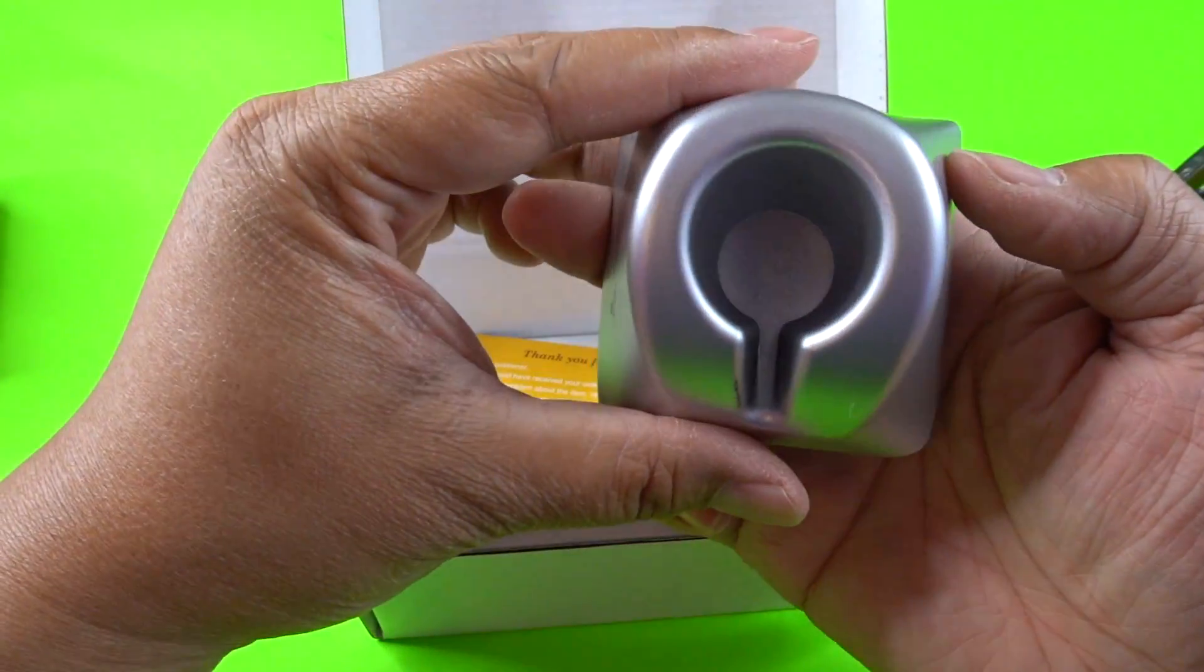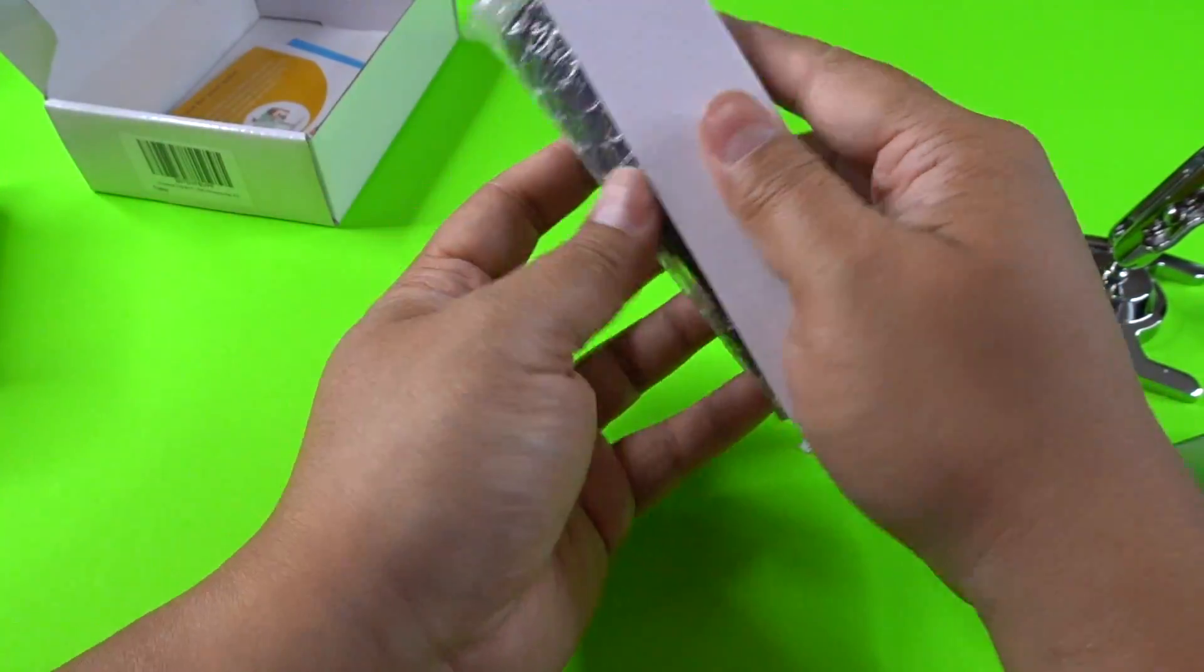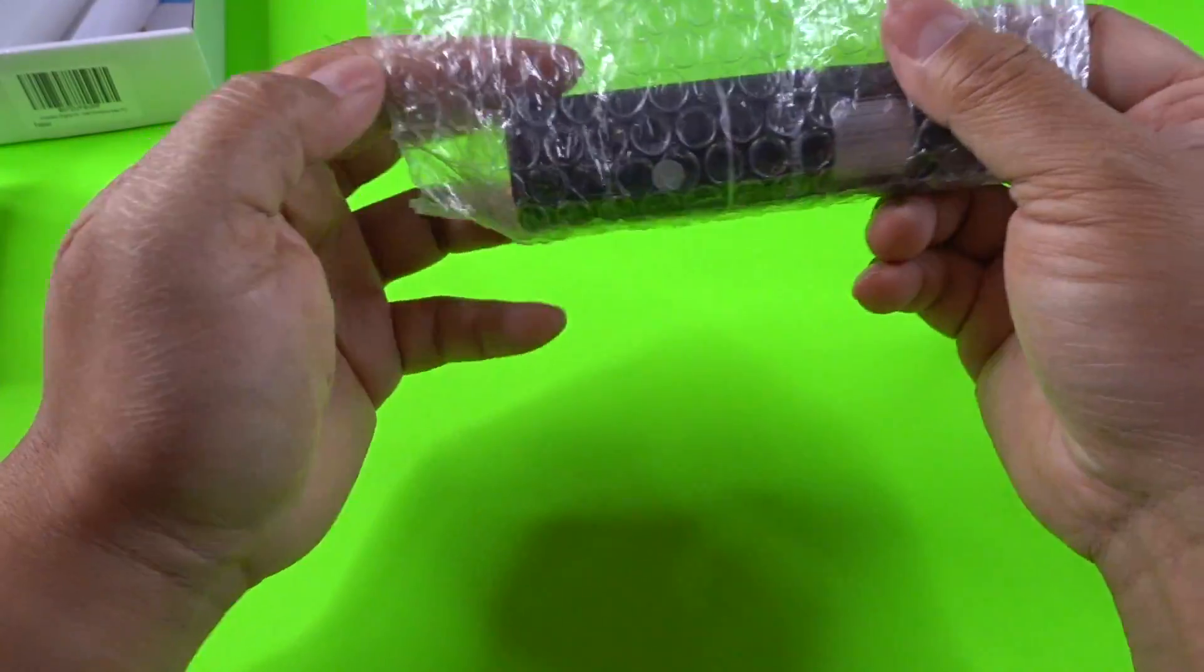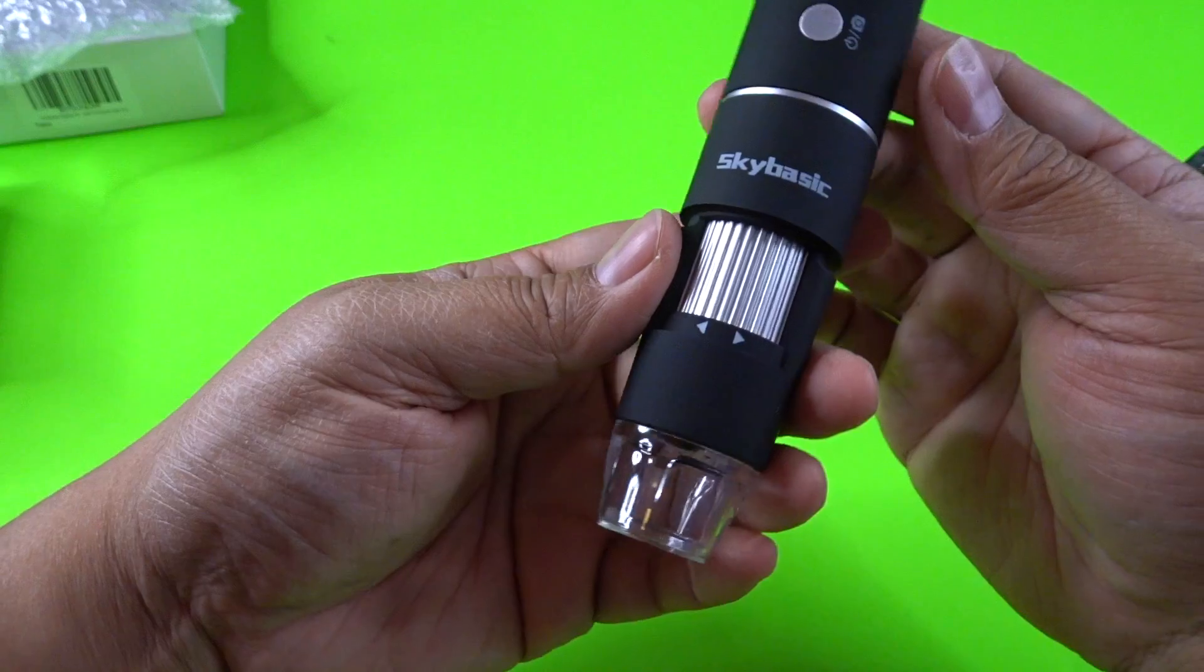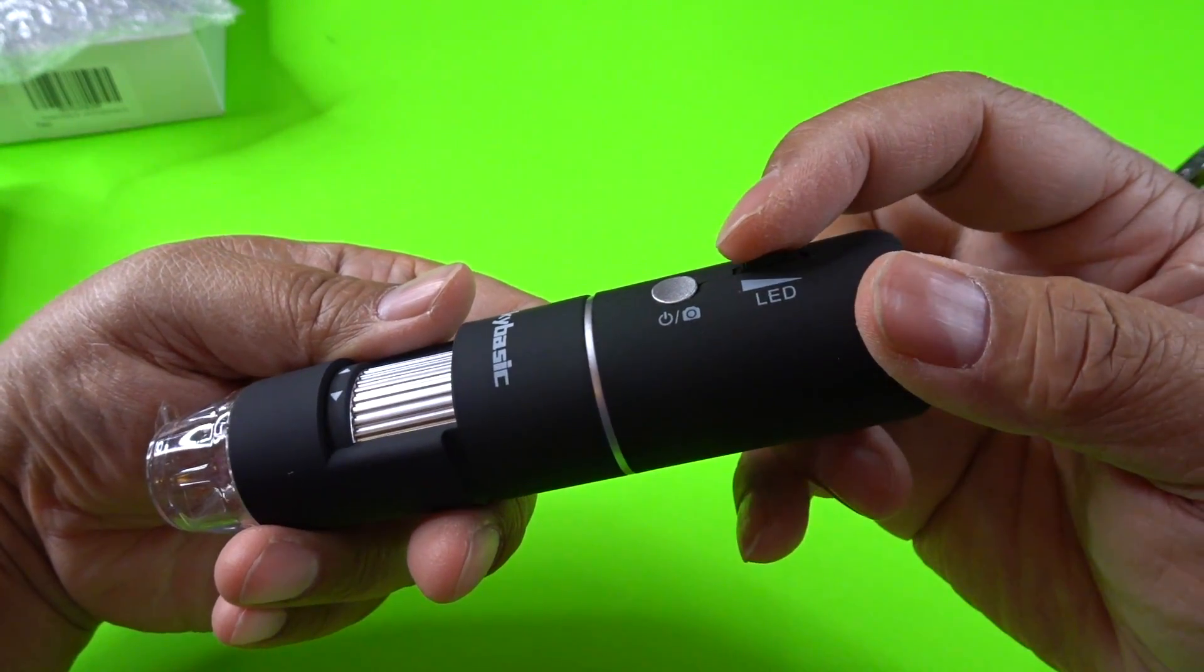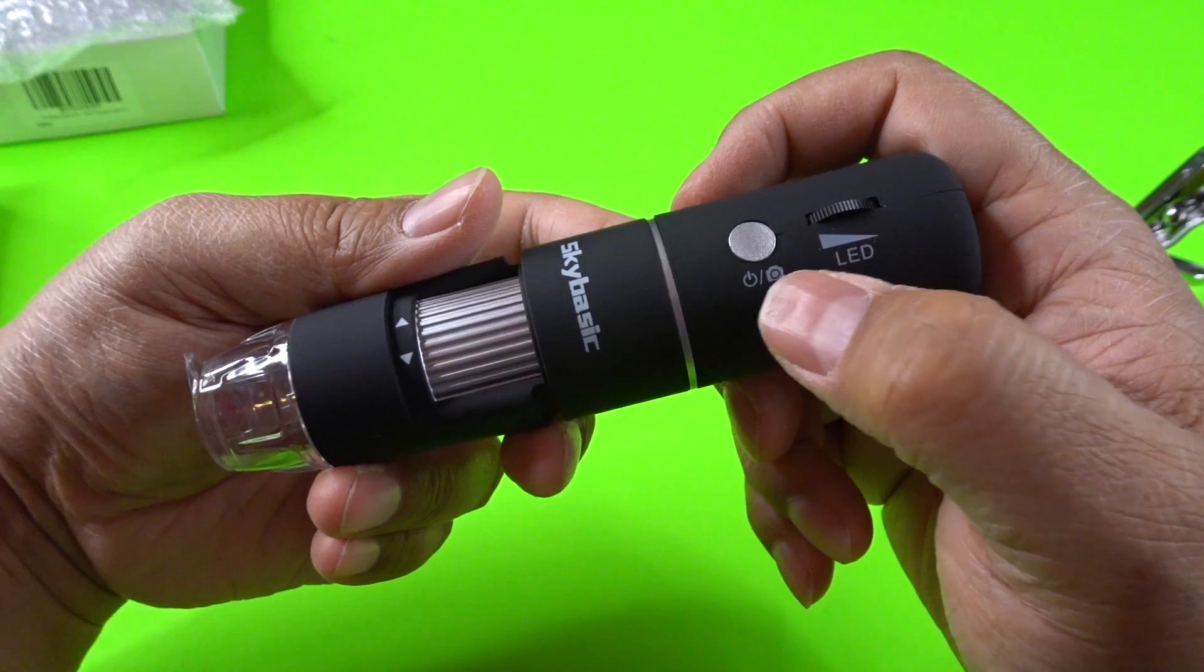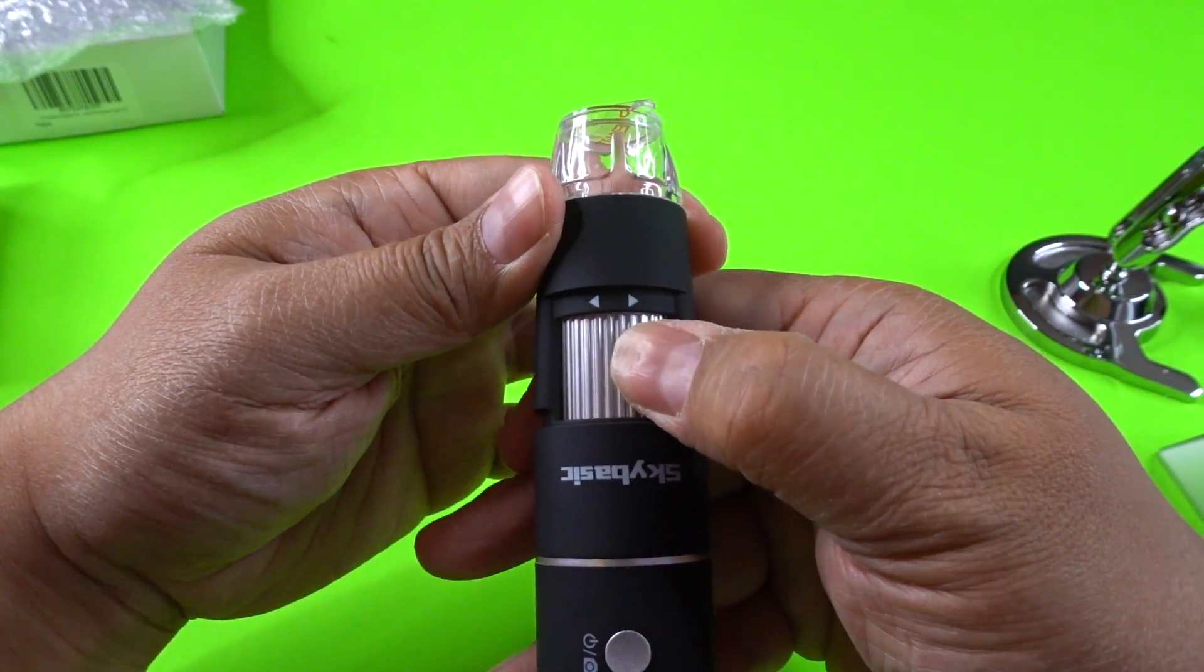Here we have another stand. There's some thank you cards and stuff inside. And here it is. Look how small this looks. This thing is ultra portable. Alright here we go. This is it. So we have a knob right here to control the LED light brightness. High to low. We got the on off switch as well as the camera versus video recording button right here. We have the focus knob right here that you can turn left and right.